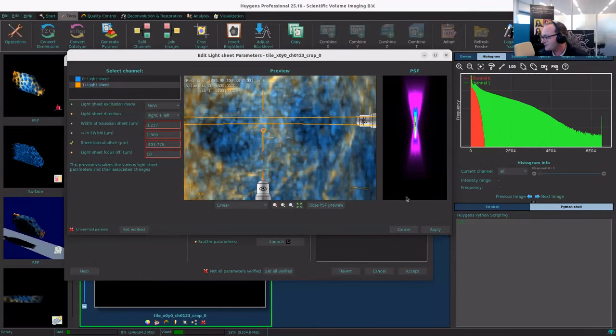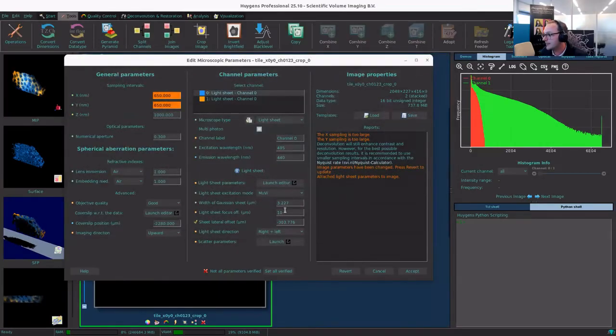Thank you. Welcome. Okay, so I set my settings. I'm going to close this, and because this is still a work in progress version, it is not updating correctly yet, but it will. So I just need to make sure that I enter these settings that we just set.